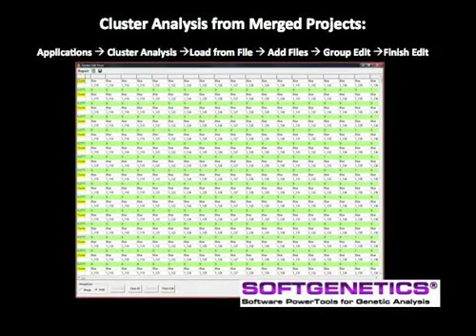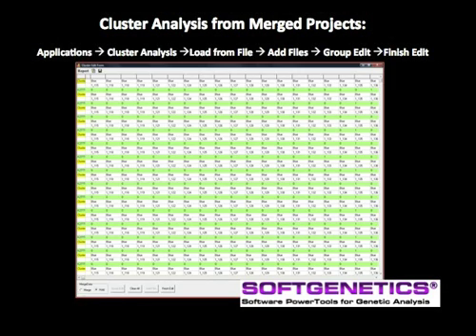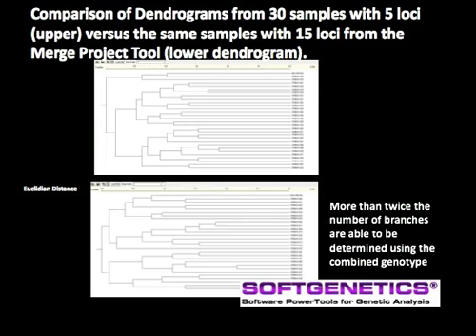The final specialized application to consider is Cluster Analysis from Merged Projects. From the main screen, select Applications and Cluster Analysis. Load the bin table file saved earlier during the merge project process. Then use the group editor to confirm the grouping of these files and click Finish Edit. Information from the additional loci of the merged project provides a more informative dendrogram. Comparing the two dendrograms, as indicated by the red line drawn here, there are three branches distinguished in the upper diagram drawn based on five loci, and eight branches for the same region of the dendrogram utilizing information from 15 loci of the merged projects.